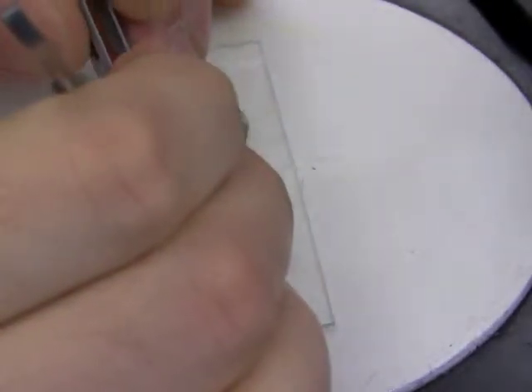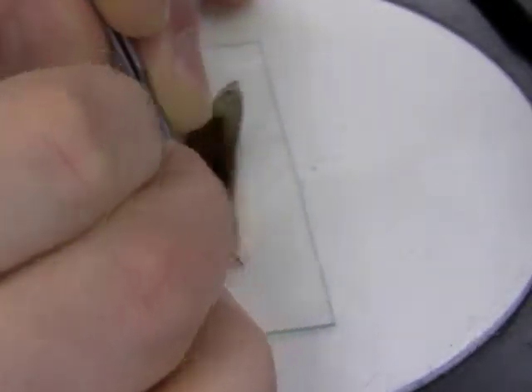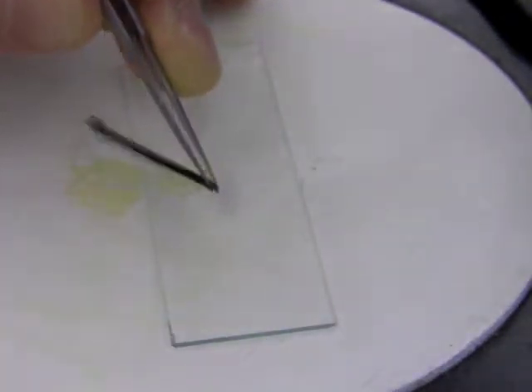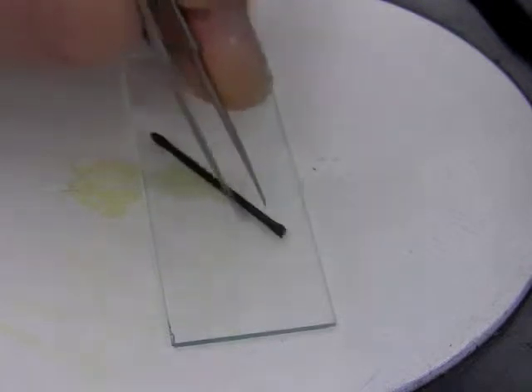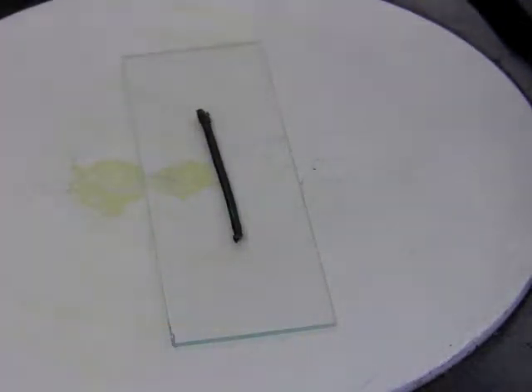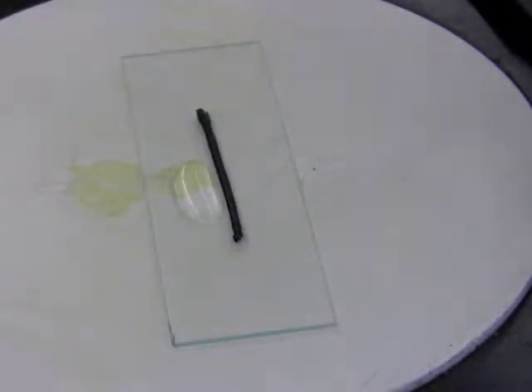You need to separate the abdomen from the head and thorax. Then add a small drop of water — smaller than that if you can.